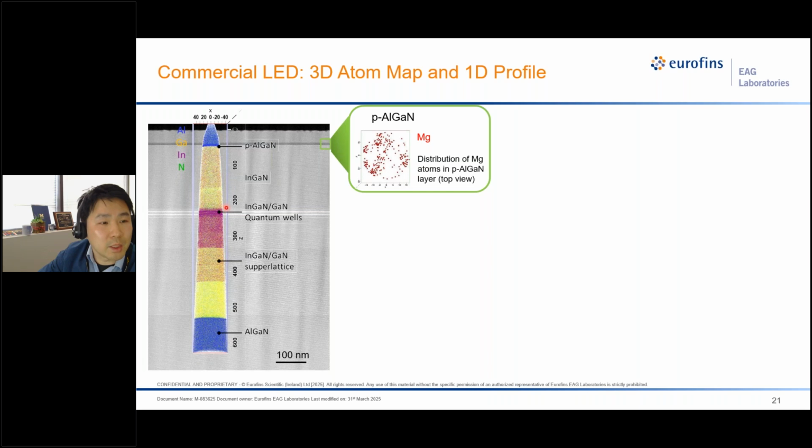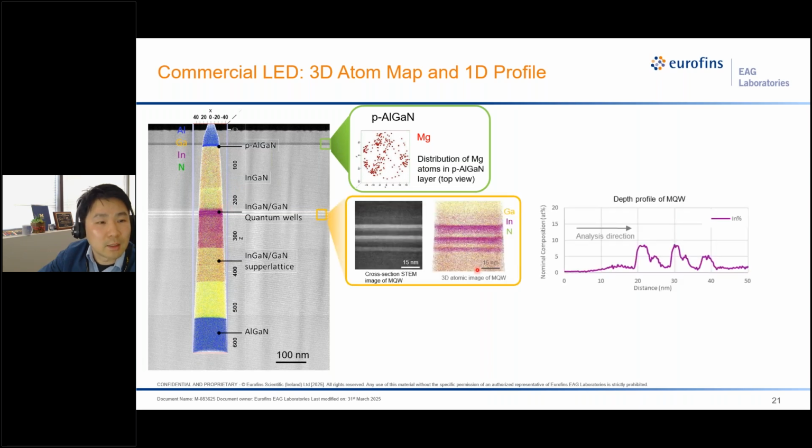And in the middle, we have the quantum well layers, where STEM imaging shows 3 layers. The first 2 are combined as the brighter layer followed by a lighter region. The atom probe data obtained from this region confirm that there are indium layers of 10% followed by another layer of 5% indium concentration. Each layer is about 5 nanometers in thickness, and we have 3 groups of them, and the composition can be obtained by atom probe.